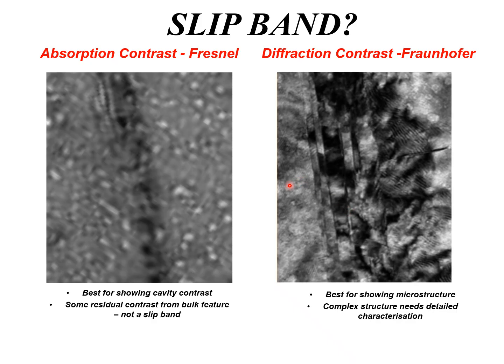If you have platelets, in order to decide whether that is a precipitate or a deformation twin or martensitic plate, you look at the chemistry. And if the chemistry is uniform and it doesn't identify as a precipitate, then it's going to be a twin or a martensite plate. Anyway, this just illustrates this structure and what was identified as a slip band, which is basically nonsense.